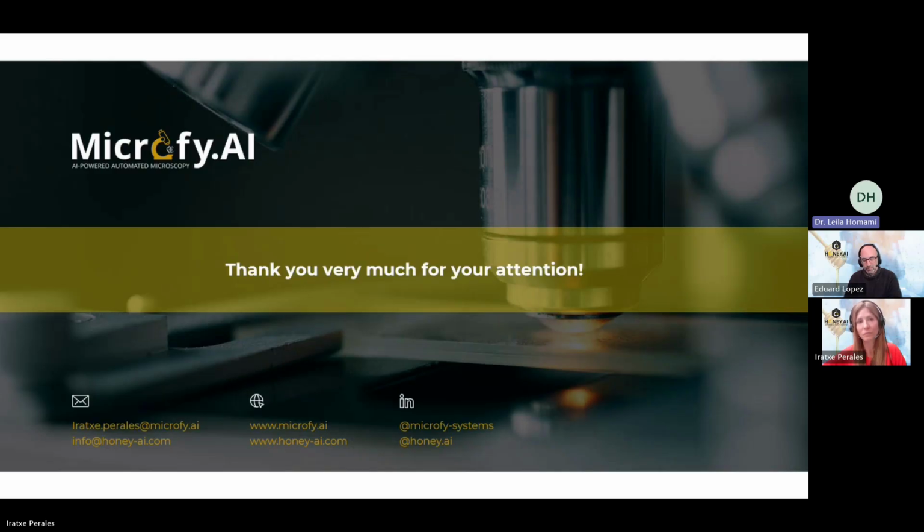My big matter is about the validation. You already answered that there were maybe 53 samples, if I don't make a mistake. I think it's not enough because, for example, for rapeseed honey, it's not too complicated because rapeseed is everywhere in the honey.